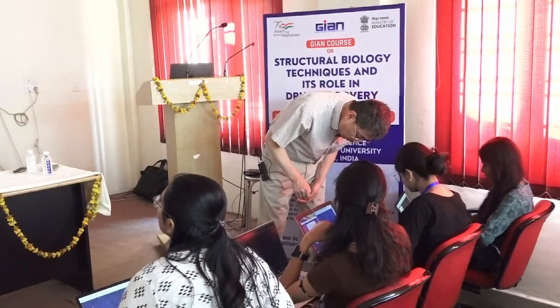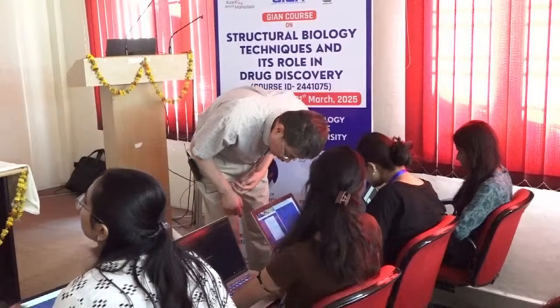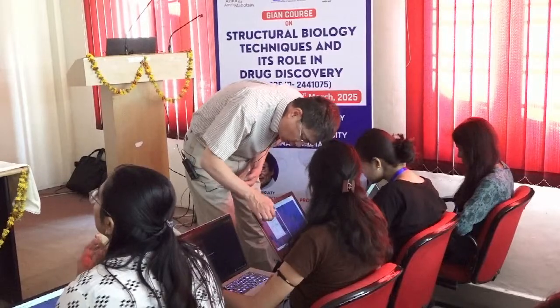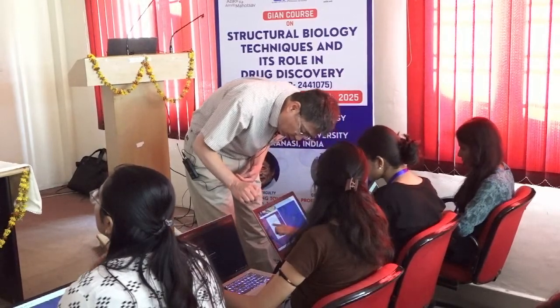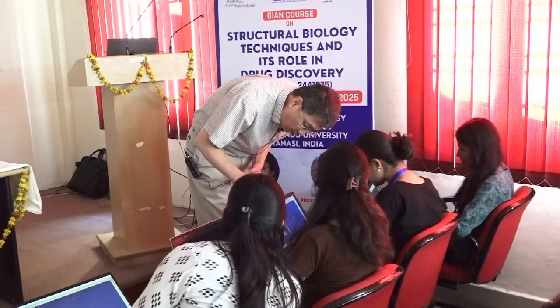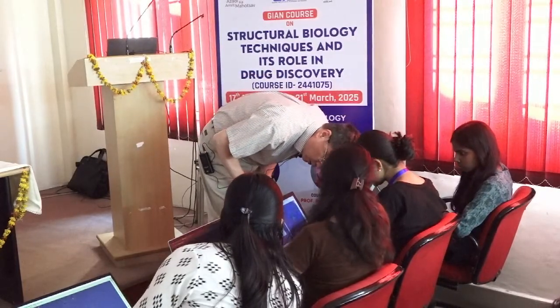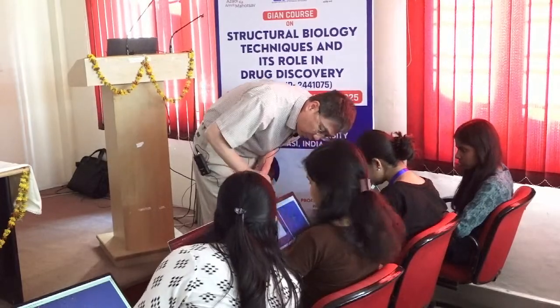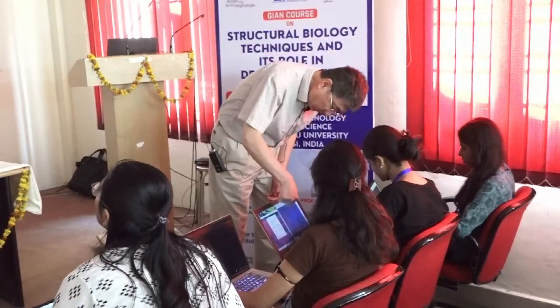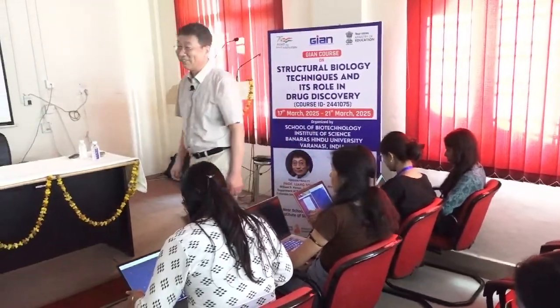This is leucine. This one is leucine. 56. No, it should be 2. No. Residue 2, not chain 2. Chain is Z. Use the drop down menu. Click on this arrow there. This one. Okay? And then you see 2 there. Click on that. You see 2? This is 2. A2, yeah, A2. Click on A2. And then say accept. There you go. Okay? Right here. Yes. Okay? No? All right.